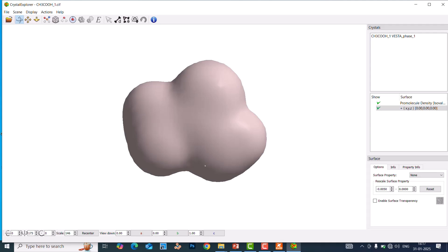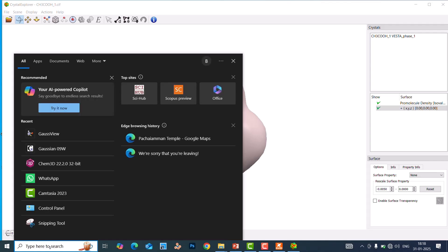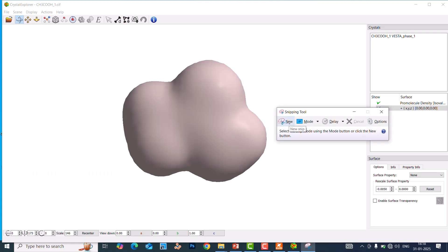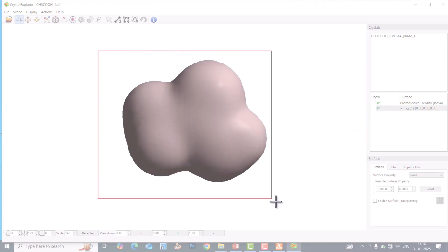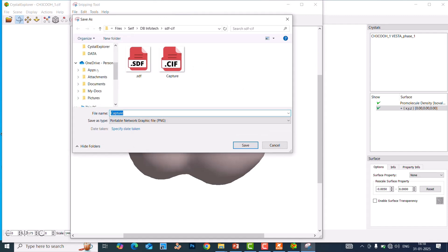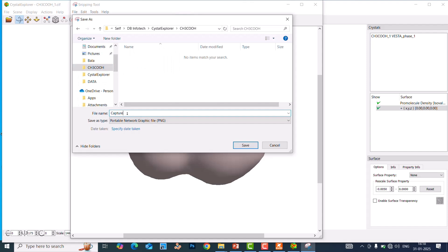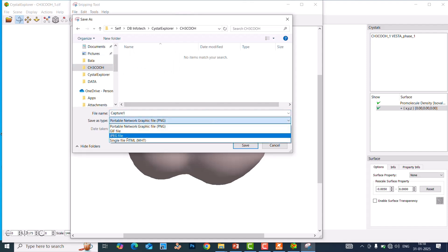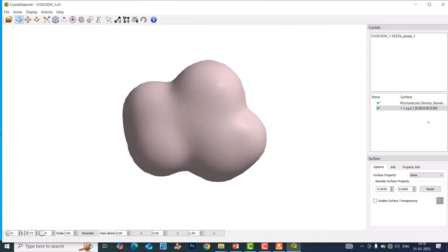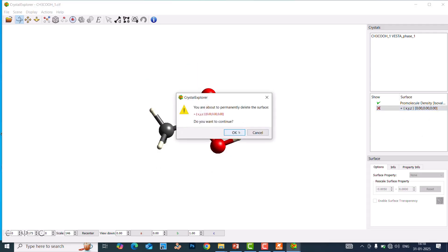There is no built-in export option for the figure, so you need to use the Snipping Tool. Open the Snipping Tool, click New, select the image area, then save it as PNG or JPG as you prefer. So we have finished the pro molecule density surface. Now I will delete it and move on to the next one.